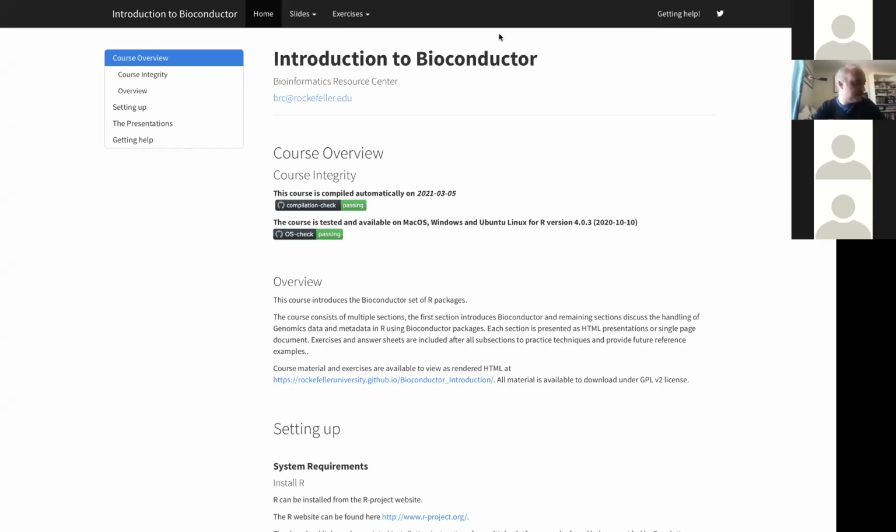The data straight from genomics. How do we go from that to something we can work with, something we can start to visualize in IGV, and then actually do some downstream analysis, count our signal in genes, compare our signal in those genes across conditions.